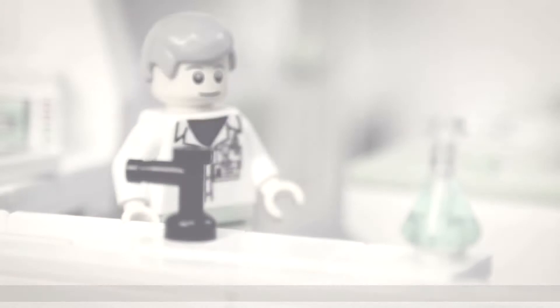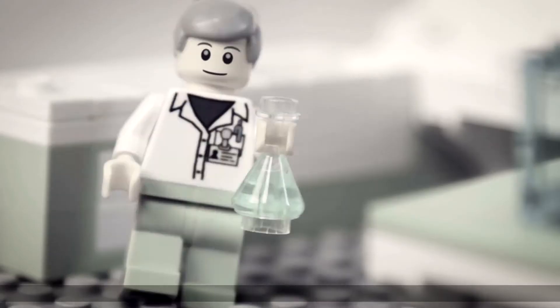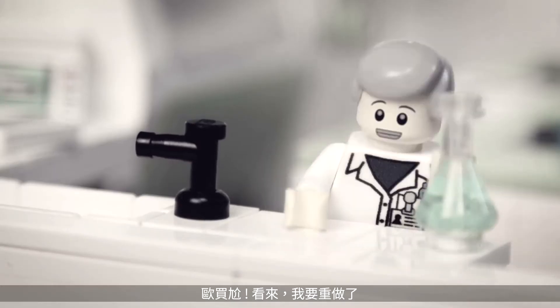Some of us remember the early days of Western blotting. I know it's a neurotoxin, but I've got to pour this gel. Oh no, the flask is slipping. Guess I'll have to pour it again.